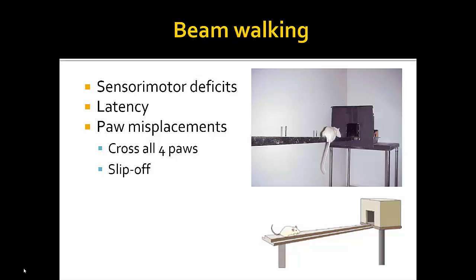So how much time does it take for them to train when they're normal, and once you induce the disorder, what happens after that? When we train them, we do 1 day of 3 trials until they get under 5 seconds. And this is where your baselines are important, because some of them will take 3 trials to do that, and some will take 10 trials. Why they do that, all we can tell is that some just learn. I think it's somewhat of a learning aspect too, because they have to know they have to get from here to here.